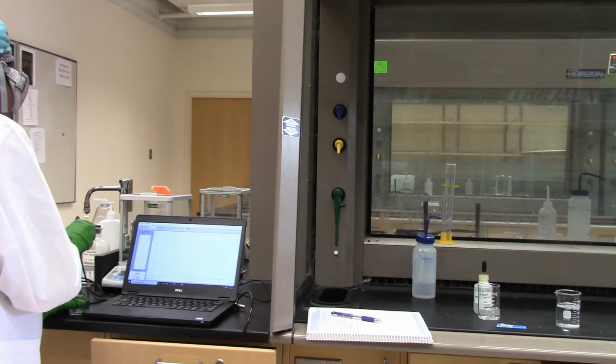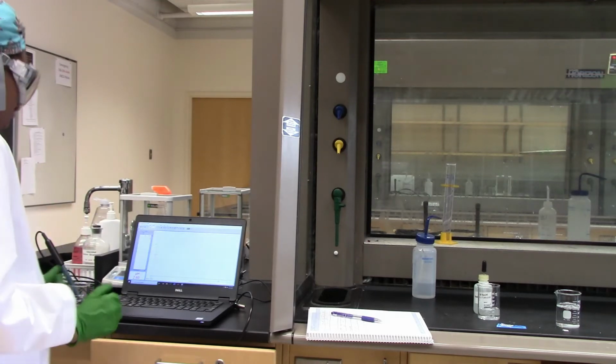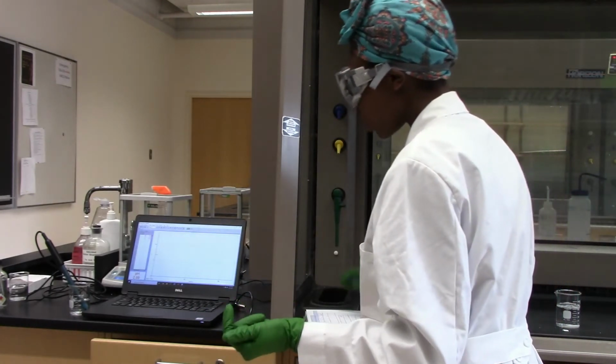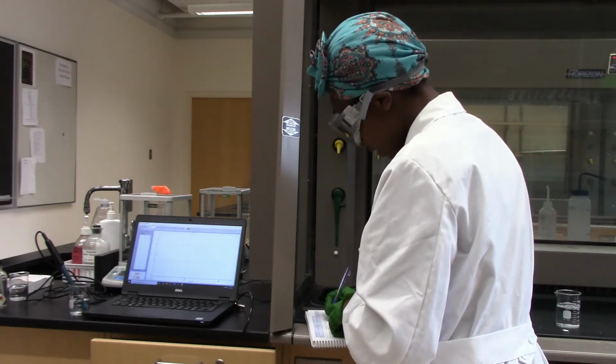And let's see what happens. So the pH is dropping. Remember we started at 7.2, we went down to 3.4, and now we are at 2.59.